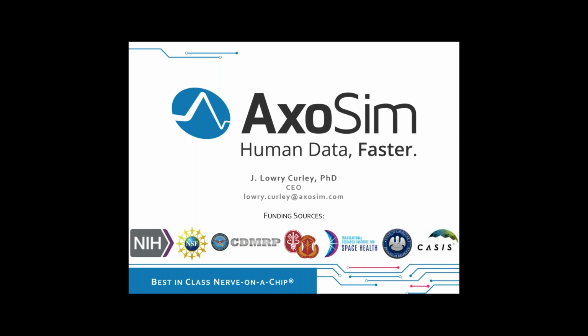Yeah, we have, and that's data that I took out of this that I should frankly add back in. We have seen that there is variability. Unfortunately, a lot of that variability seems to be coming from the cells themselves that we add in there, especially with the iPSC cells, as that technology is still evolving. And so we have done a lot of that. There are acceptable levels of reproducibility in there. But what we've found works best to use this system is to spread out our testing across 3 different batches or 3 different weeks. So what that means is we'll typically do an N of 6 in our system.